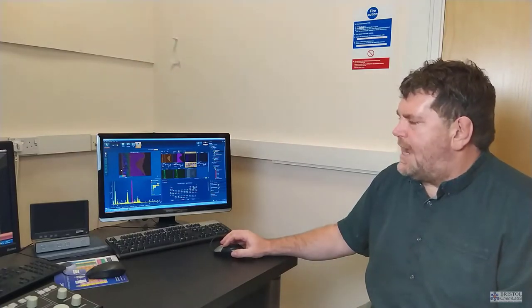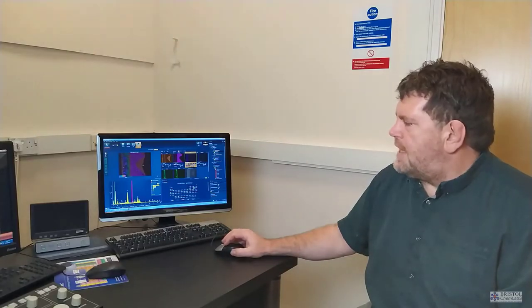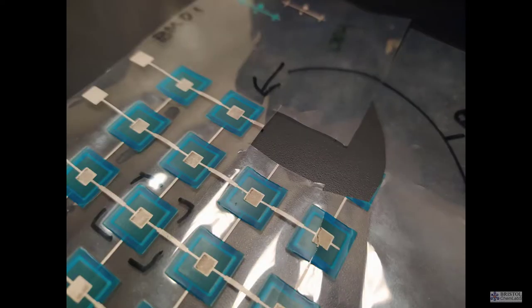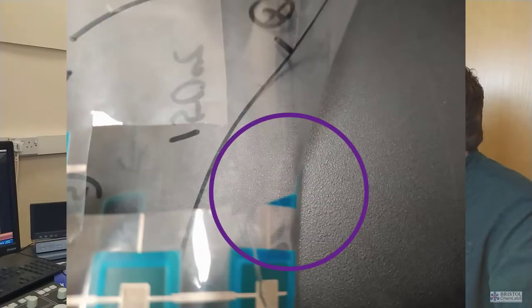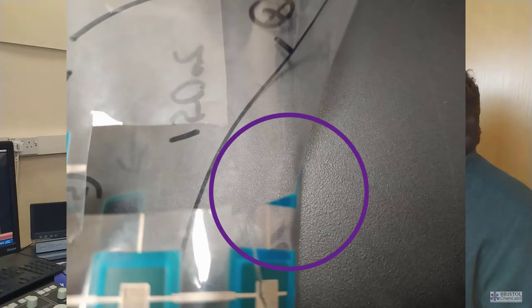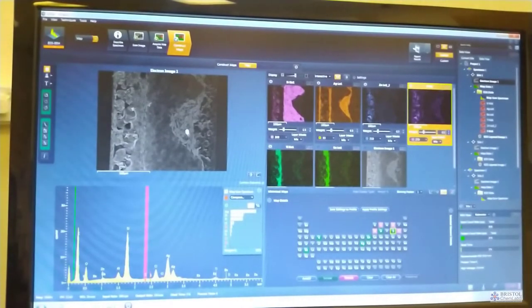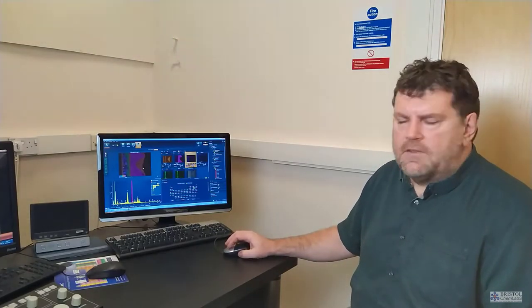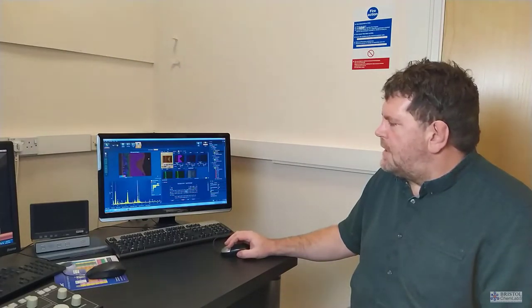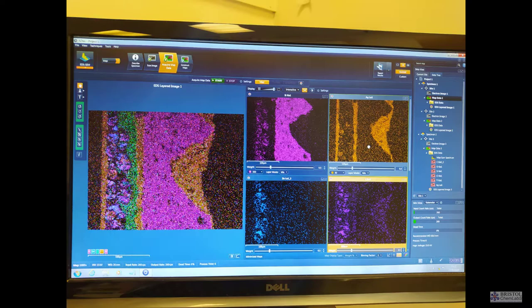This is an example of a flexible electronic material. Again, this sample formed the basis of a final year undergraduate research project. In this case, they were interested in knowing how well their method for depositing multi-layers to produce flexible electronics were working. Morphologically, it was clear. This is a sample that's been cut in cross-section. The layers should be smooth. Here we can see the electron image of the sample and you can see it's got an egg box like feature at the surface. So morphologically, in the secondary electron image, we can see it's not a flat surface. But by collecting the element composition and mapping, we can see which elements are distributed throughout that multi-layer composition. This magenta color is characteristic of silicon.